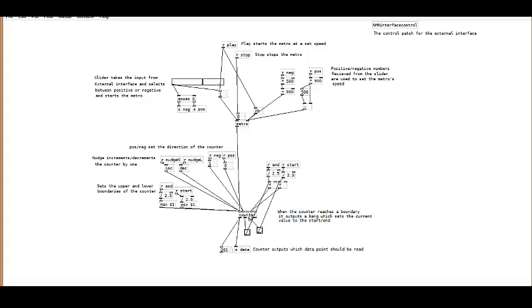We've switched out the counter, which was just a float with an addition, to use the counter object in PD. This has a number of benefits in that you can set the start and end position here. Oh no, set the maximum and minimum using these messages here.